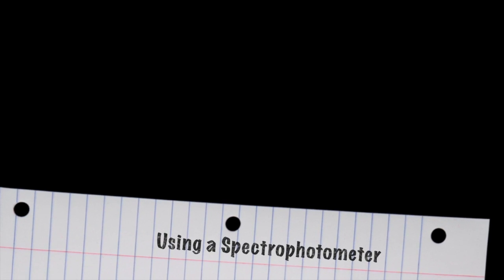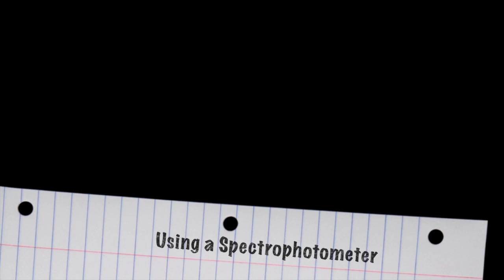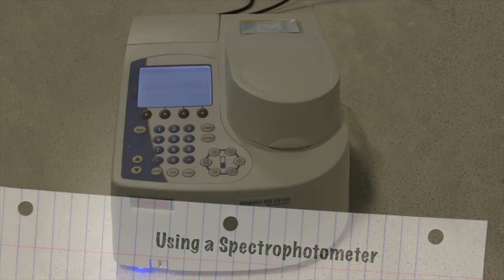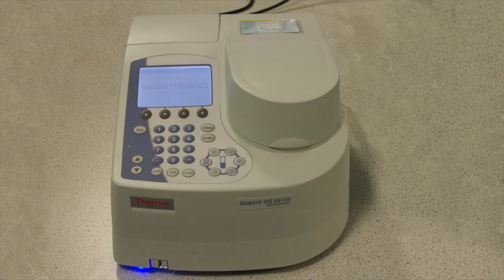This video is designed to show you how to set up and to use the spectrophotometer. A spectrophotometer is an analytical instrument used to measure the intensity of a light beam at a fixed wavelength as it passes through a solution.